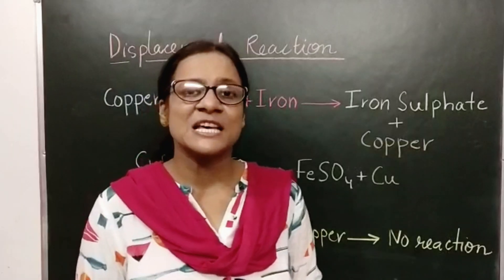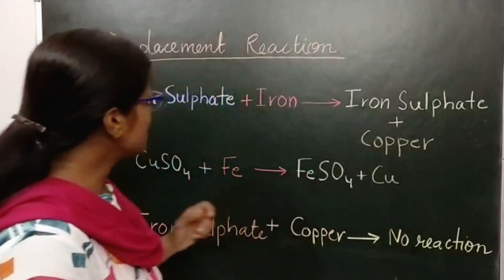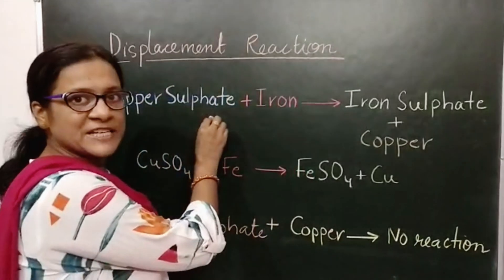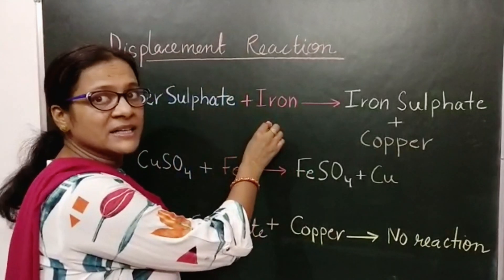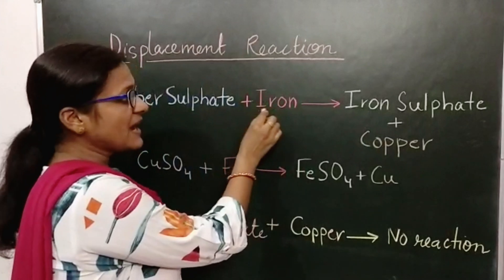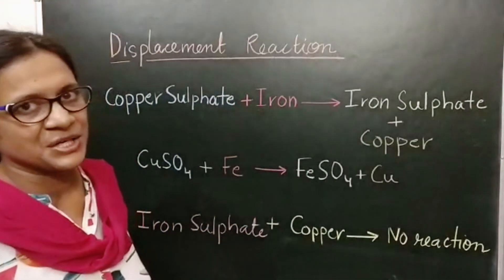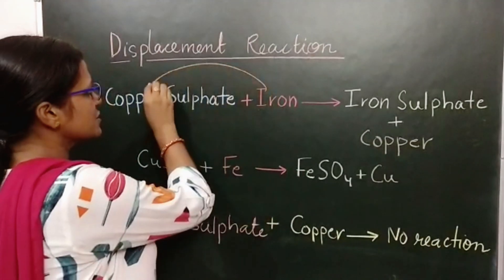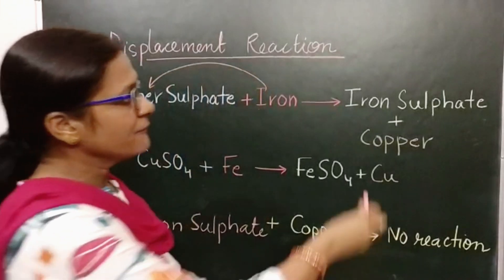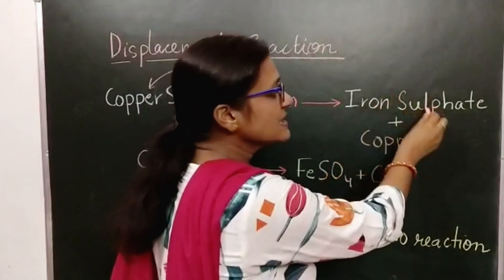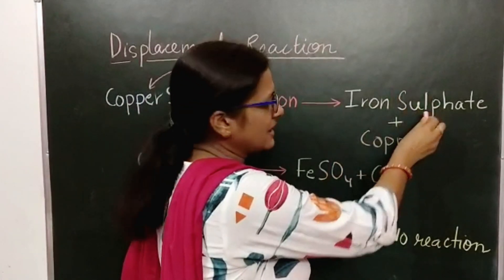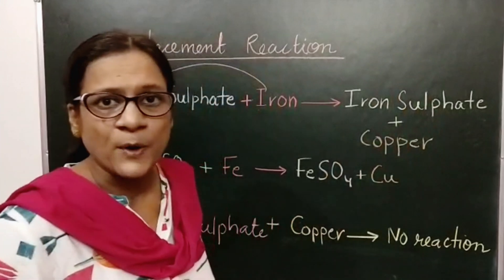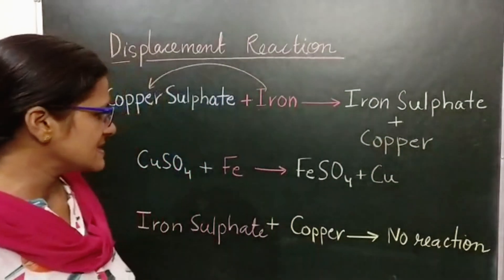This is a displacement reaction. When the copper sulphate is reacting with iron, this iron being more active is replacing the position of the copper and forms iron sulphate, which is green in colour, and copper is deposited on the iron nails.